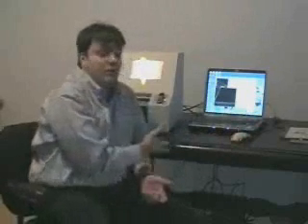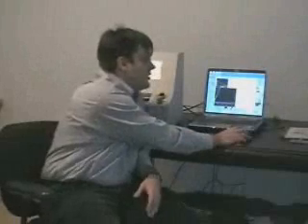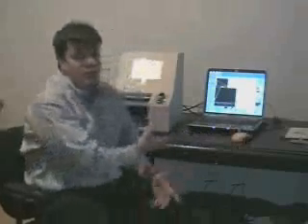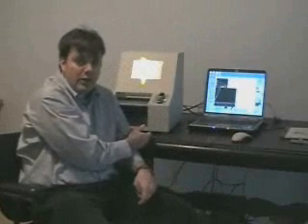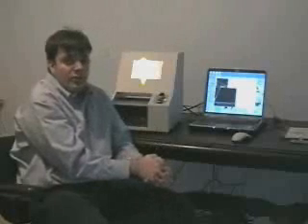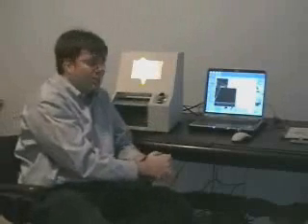Again, in my particular case, nothing happens. Therefore, I know that 1 is not correct and 2 is not correct. Uncheck Calibration Mode, go to COM port 3, click on Calibration Mode. Still, for my machine, nothing has happened. Of course, once your machine turns on, you know you have specified the correct COM port, and we are almost done. But let me keep going until I find the correct COM port.